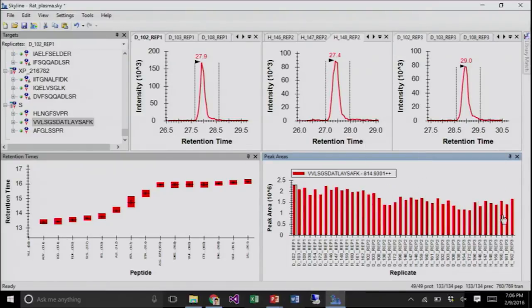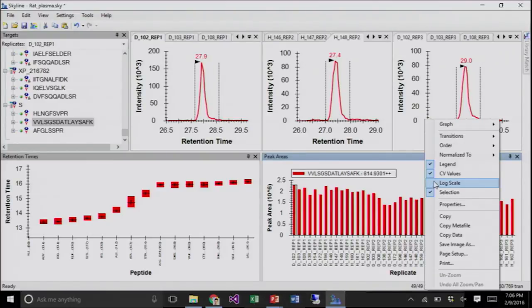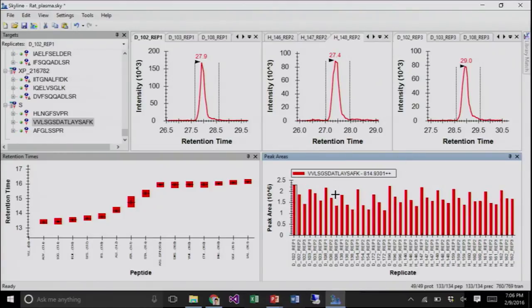So we see the systematic degradation of our standard over time, and when we go back to document order, we see that very pronounced sloping over our subjects, similar to what we were seeing before. So this might be good to normalize our data against.